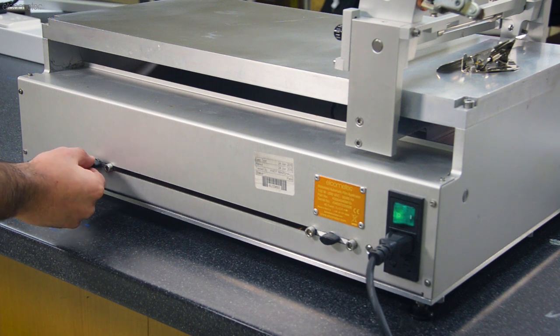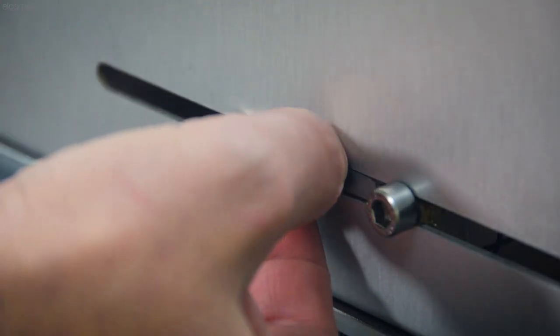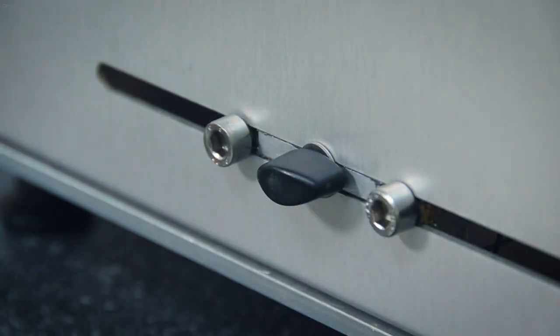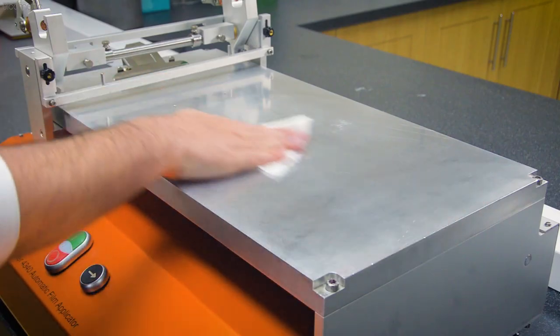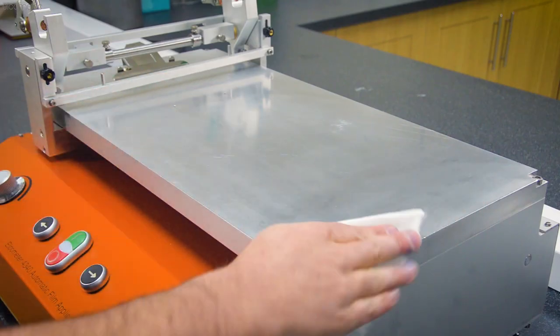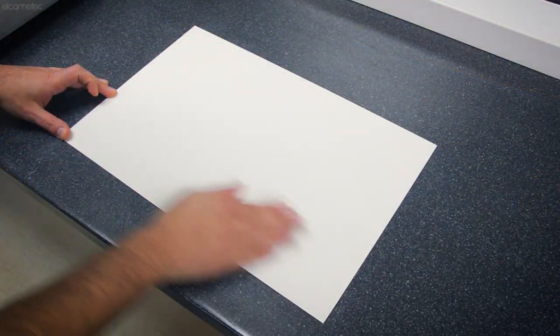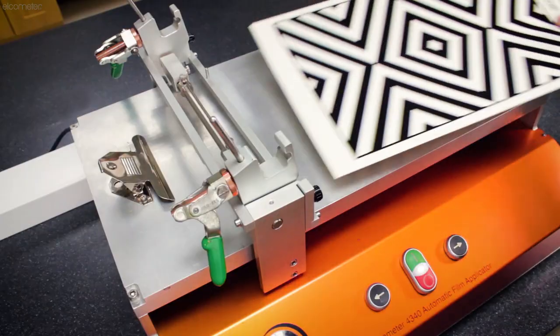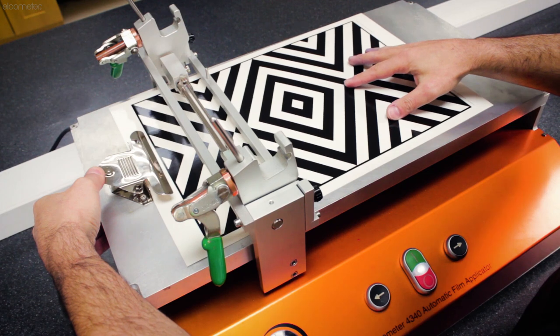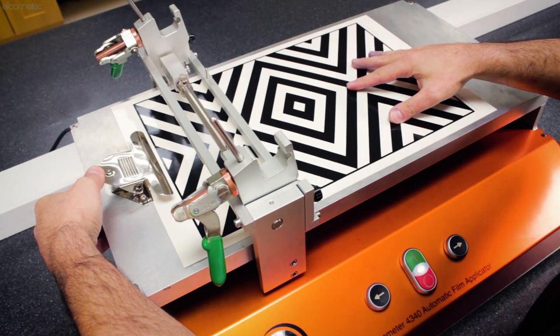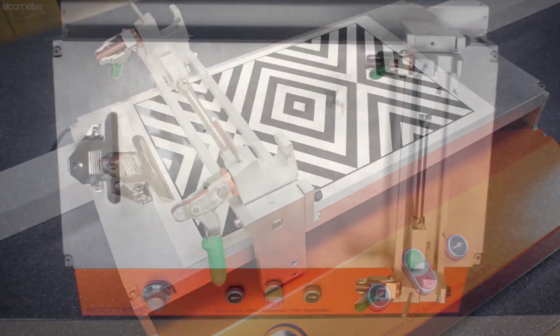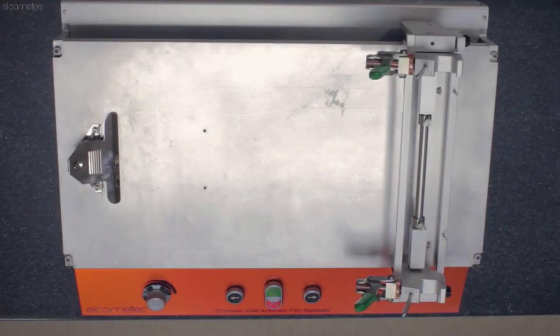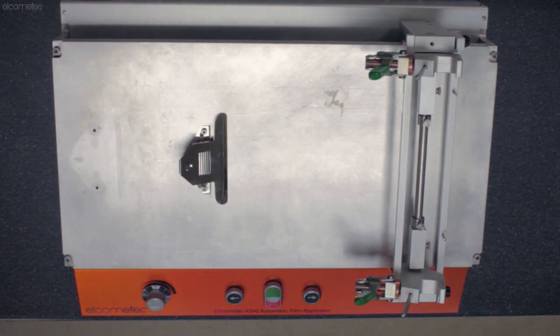With the applicator's speed and distance set, you can now mount the substrate to the table. Regardless of what kind of table you're using, make sure the table and the underside of the substrate are both clean. On a standard table, mount the substrate securely using the spring clamp. This clamp can be attached at two locations on the table: one for A3 sized substrates and the other for A4 sized substrates.